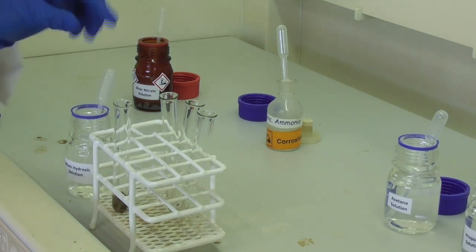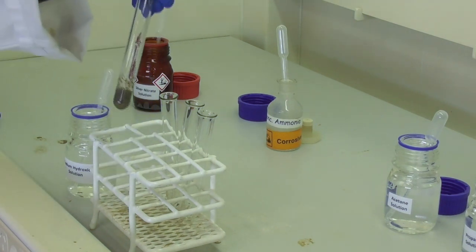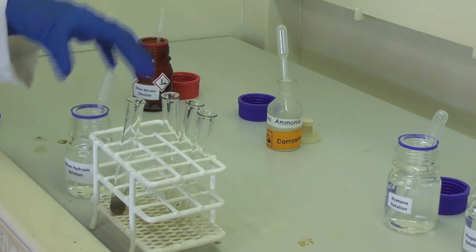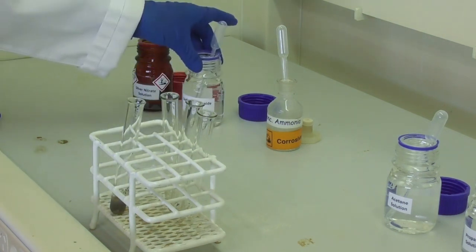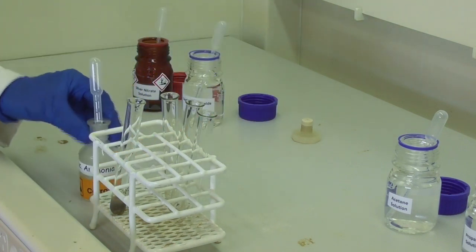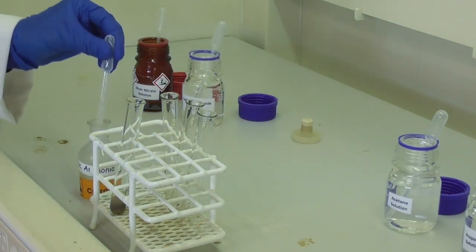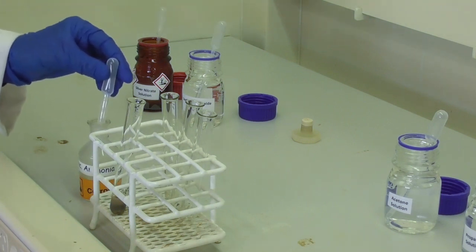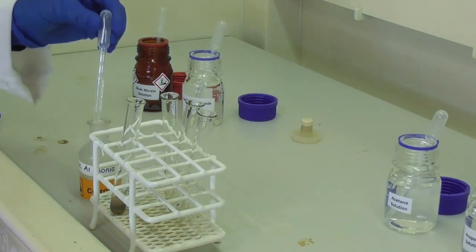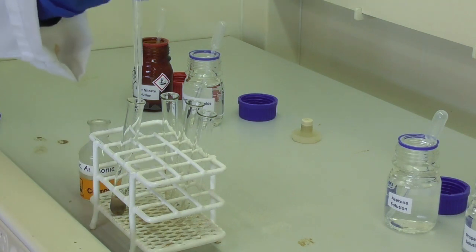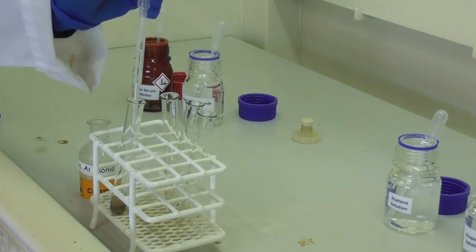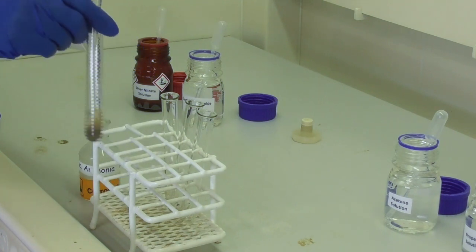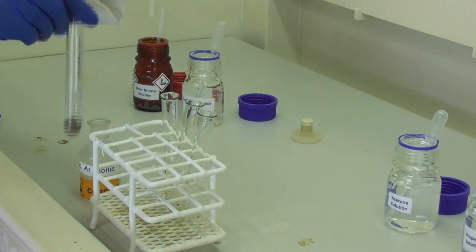This results in a dark precipitate. The third reagent in the preparation of the Tollens' reagent is ammonia solution. We add between one and two milliliters of ammonia into our test tube and shake it really well.